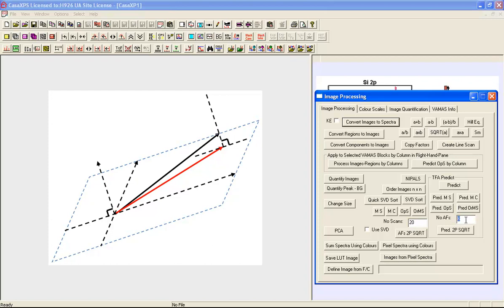The same concept applies: we specify a subspace now defined by the PCA-calculated vectors. When we've established that there are four significant abstract factors, specifying four means we will project our entire image data set of 65 images onto a four-dimensional subspace spanned by these four abstract factors - equivalent to a four-dimensional plane within the 64-dimensional space. Everything that doesn't project into that four-dimensional space is considered to be noise. That is the basic principle of how noise reduction by PCA is performed.